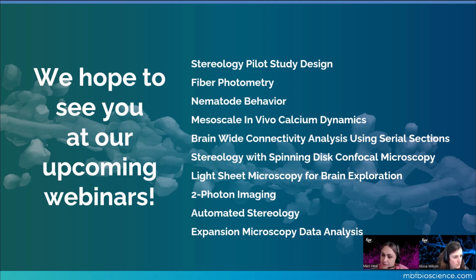Someone's asked if this can be used to trace neuronal growth in 2D culture, and absolutely. Just like we support many file formats, we support data from different modalities, both 3D and 2D data. So the tracing algorithms will also use the information from just a single plane in addition to a 3D stack.